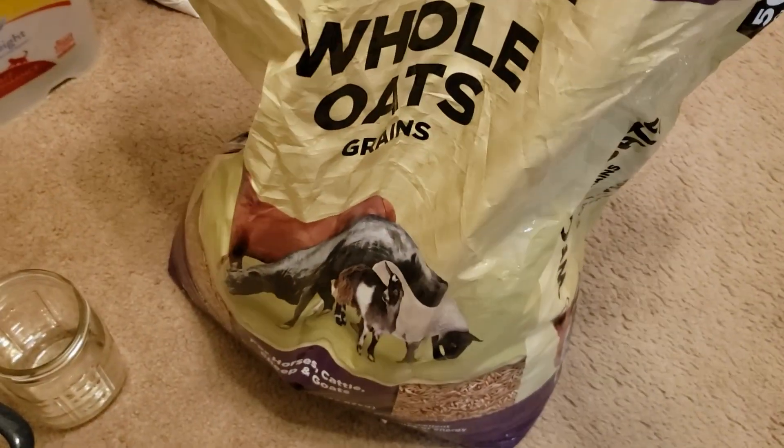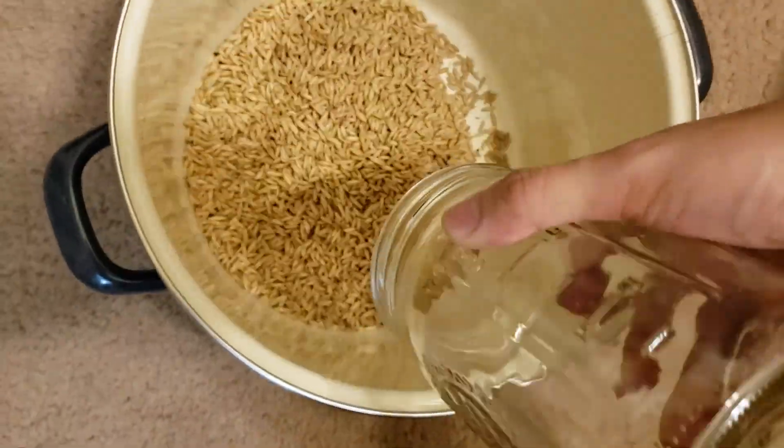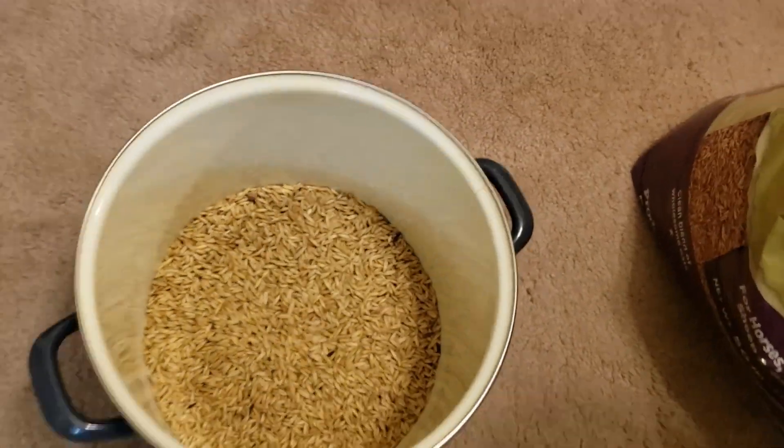With that much grain you're going to be able to grow mushrooms for a very long time. I'm going to measure out four quarts of whole oats — this is enough to make about eight or nine jars of grain spawn. The rule of thumb here is to measure out about half the amount of jars you're looking to get. The oats are going to expand when we boil them and absorb water.